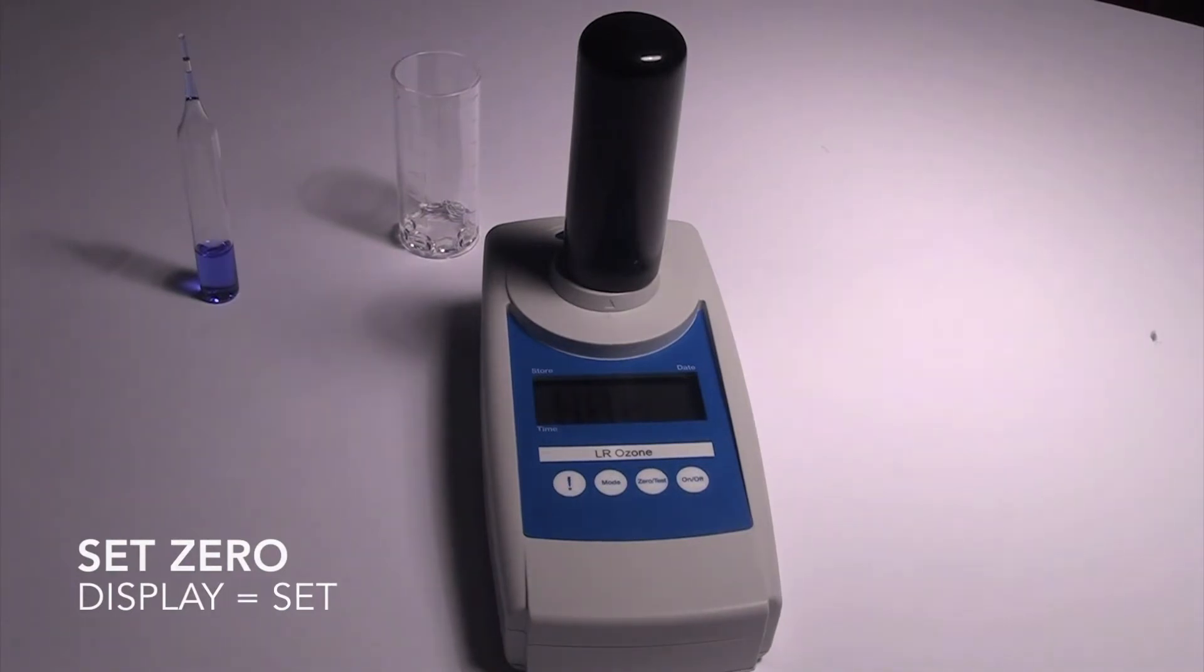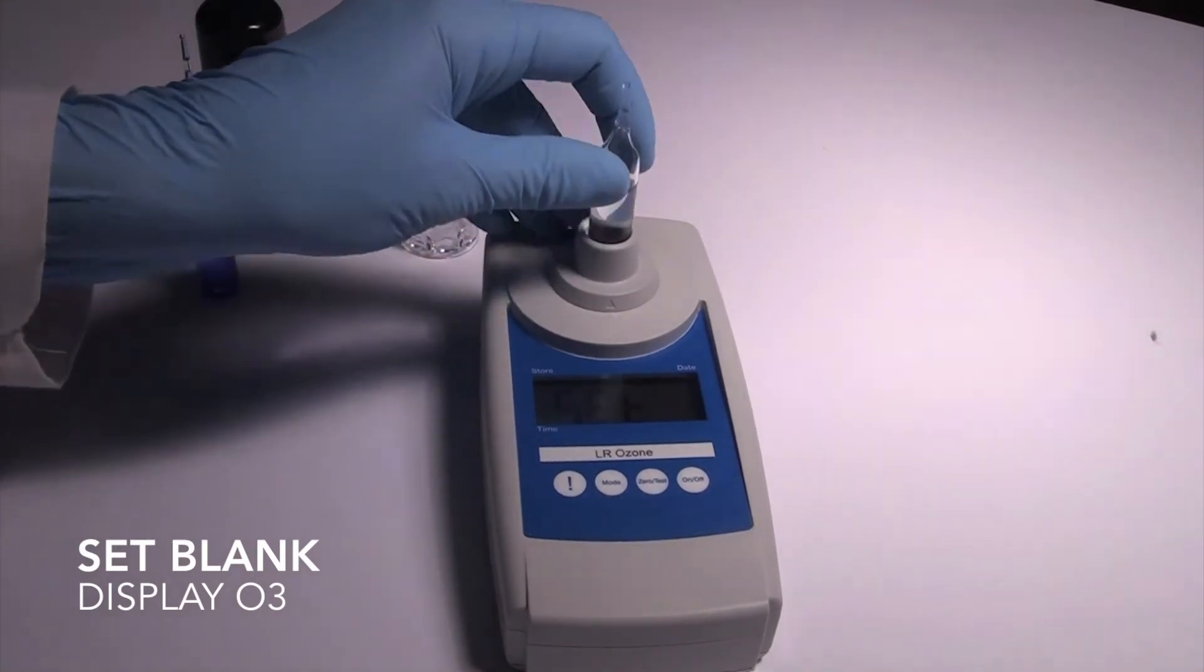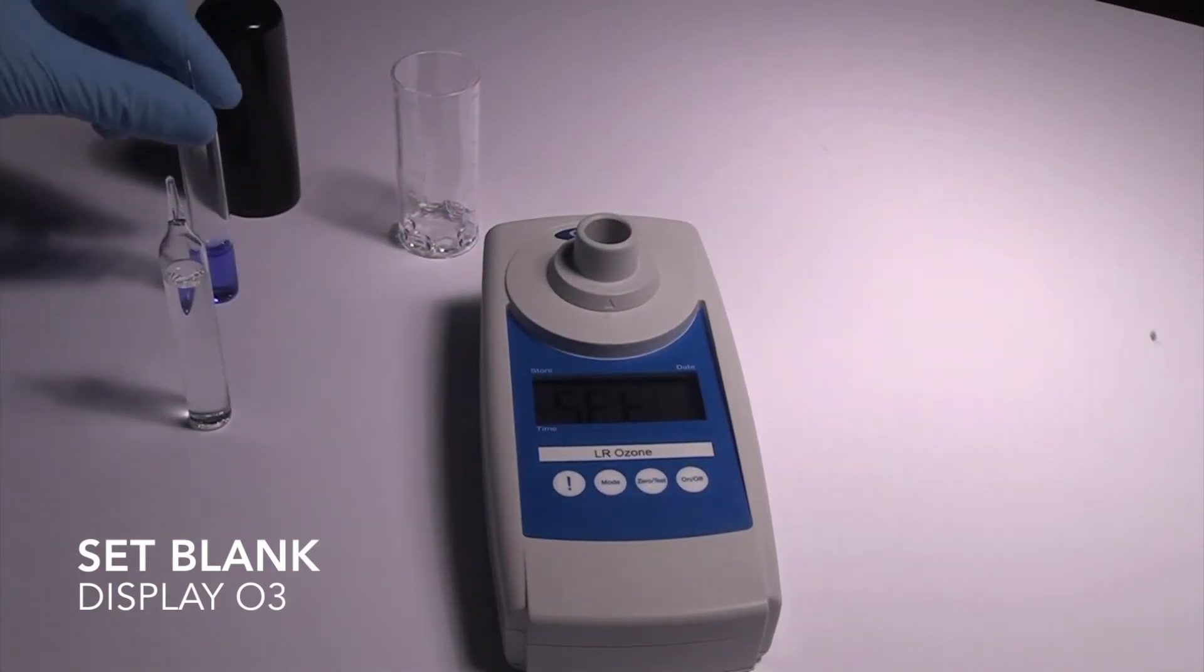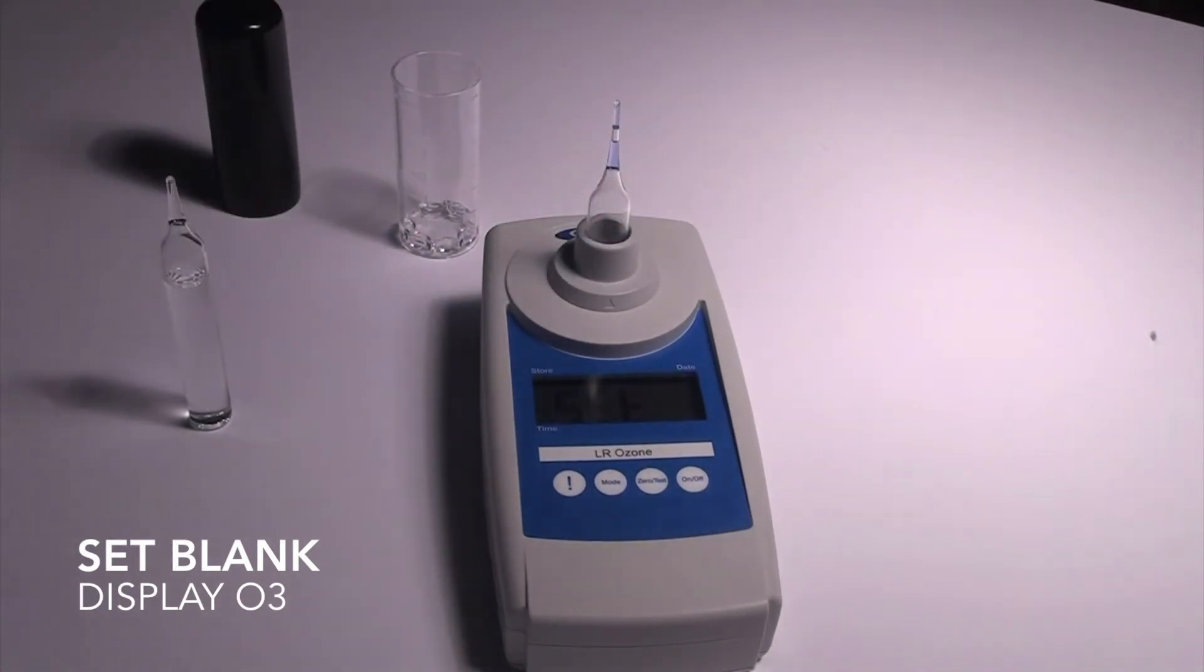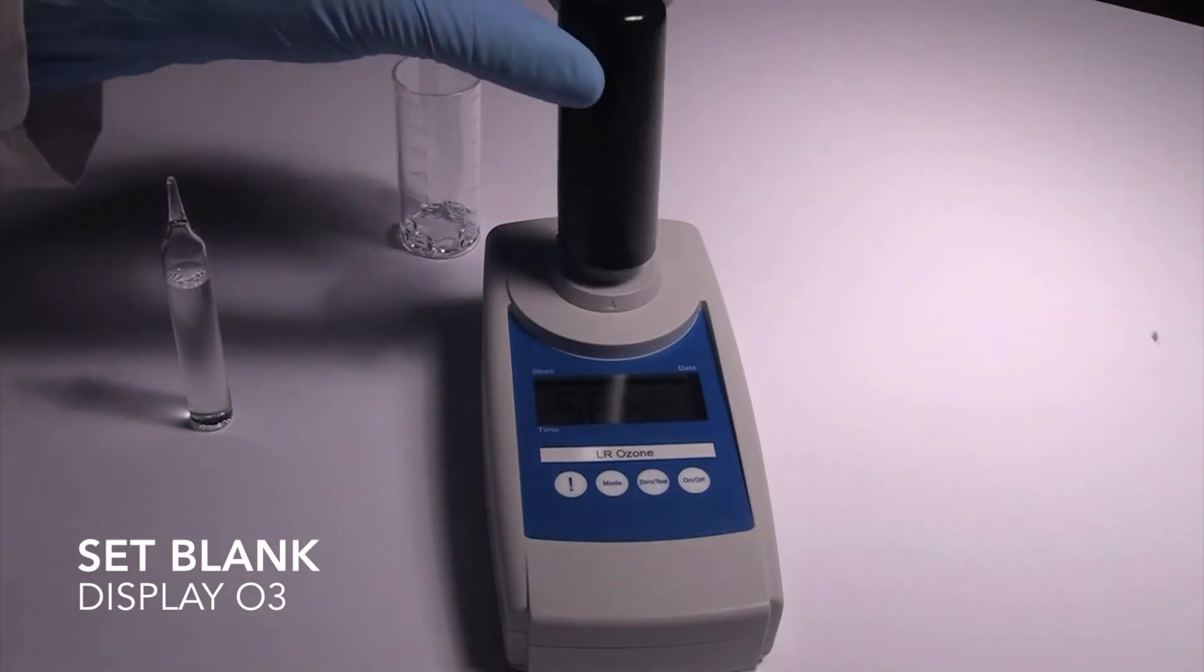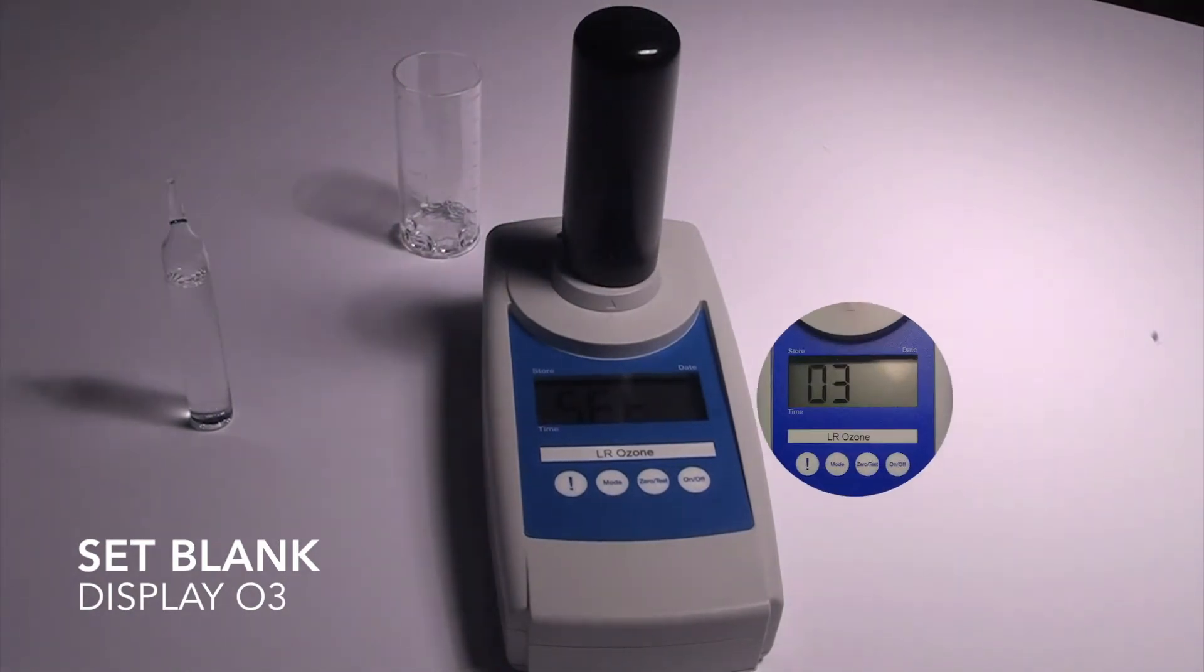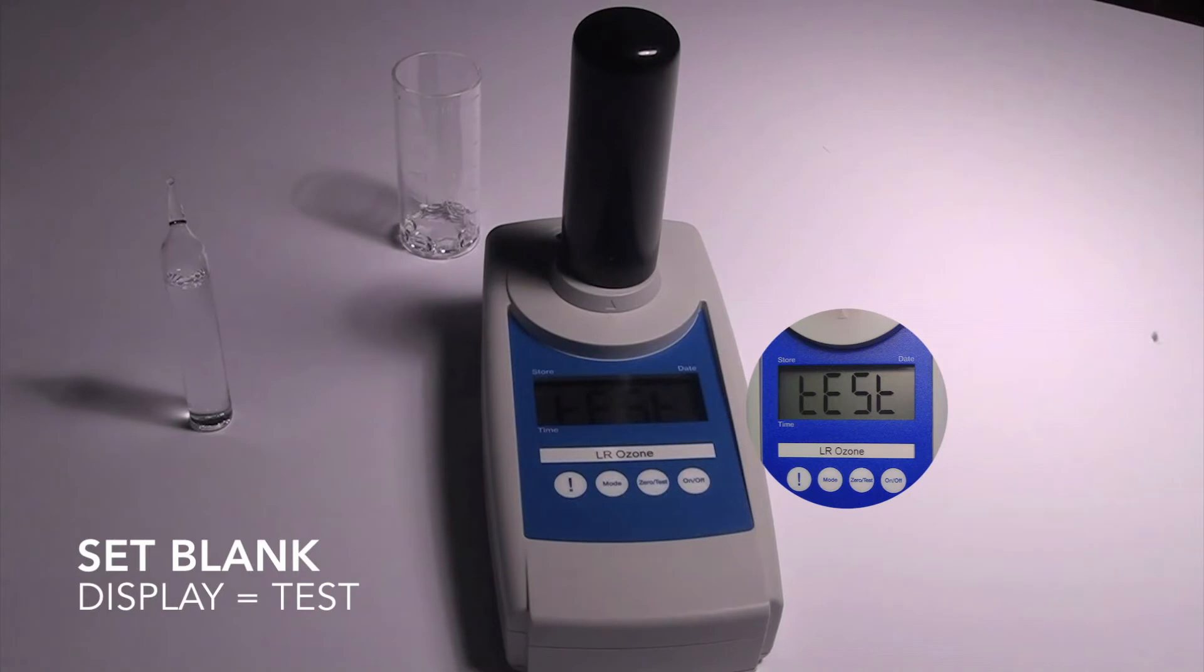Next, generate a reagent blank value. The SAM has now stored a reagent blank value for this ampoule.